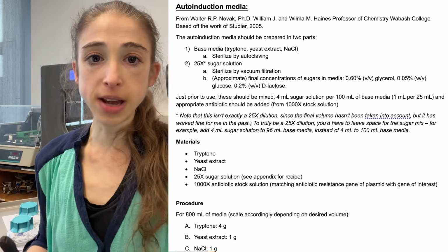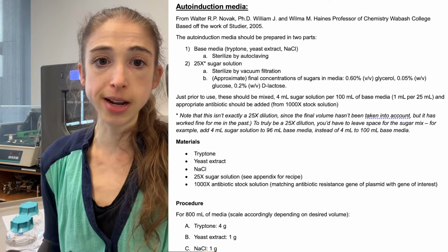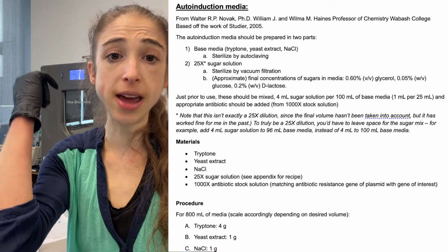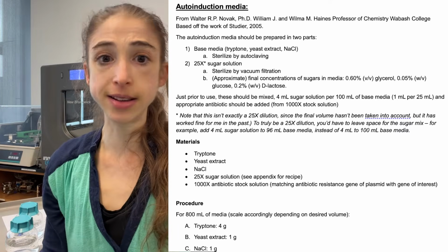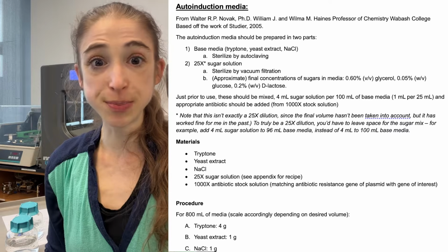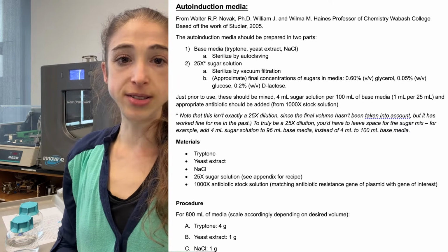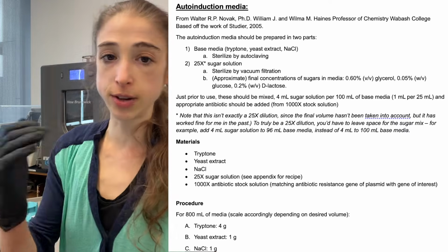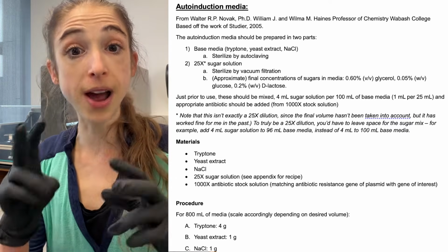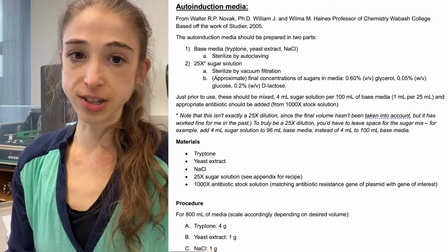So there's some more complicated formulas for making auto-induction media, but we found this really simple way is just really easy. And so thank you to Walter Novak for telling us about this protocol. And this media is a lot easier than the ones that you see originally published, but those originally published ones are more of a defined media. So if you want to have really good consistency, then that's where to go.